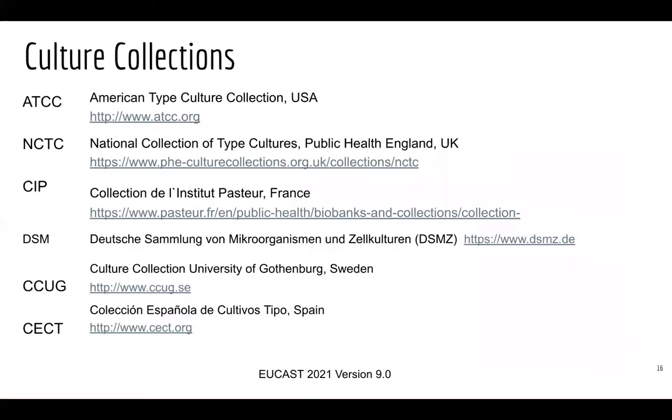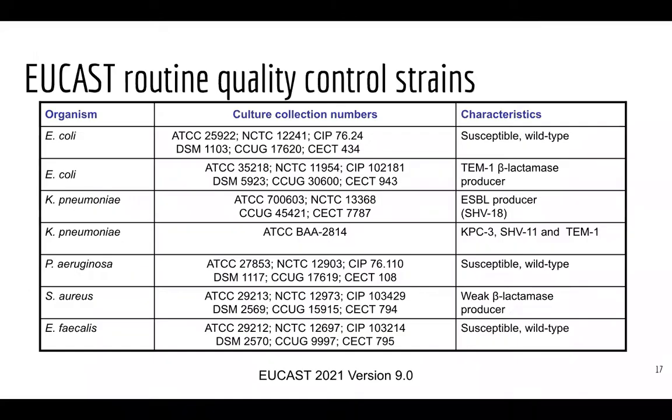So here are a few culture collections, and there are big catalogues where you can see what various strains you can get. This is especially good for quality control strains, or just if you're interested to see what strains your new antimicrobial might affect, or if you've got a hypothesis of various antimicrobials having a synergy if they're together, then that's an interesting way of doing it as well. So yeah, you can go back to this later on, and this will also be available on the MOOC online.